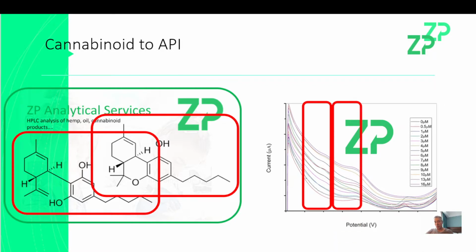Not that electrochemistry is necessarily important to this discussion, but the whole thing about electrochemistry is it allows for a low cost platform, and you can use it on essentially dirty samples, like saliva, like blood, like an extract of hemp, for example. So we're expecting that there are entrepreneurs out there who want to develop a technology, they have a market, they have an application in mind, and they want to make a real acceleration in their progress.